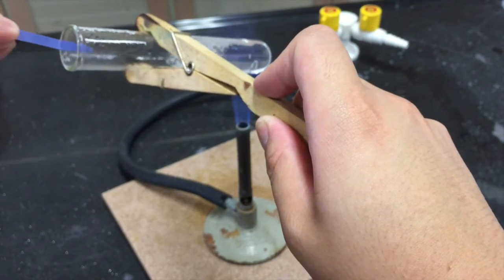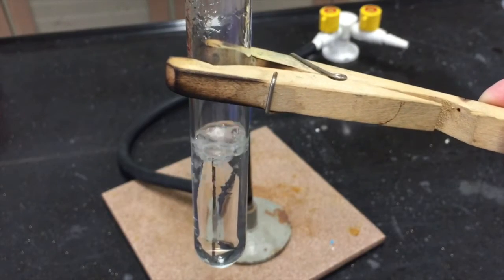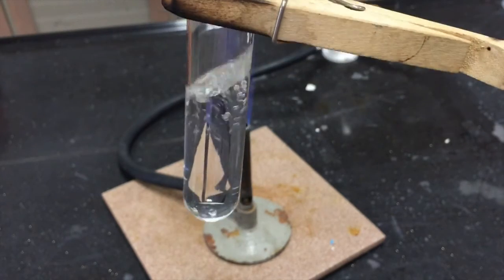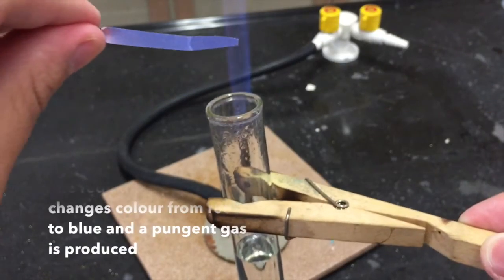You will notice that the red litmus paper changes colour almost immediately. The colour change is from red to blue.